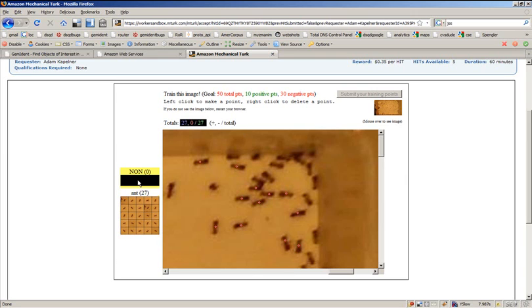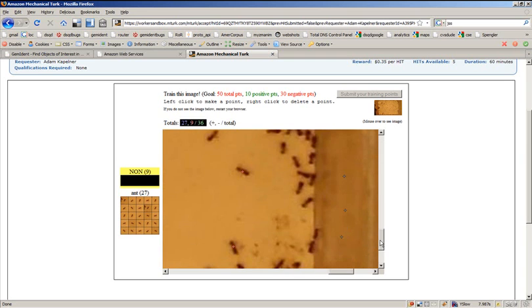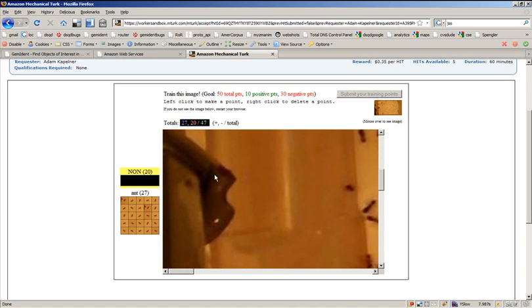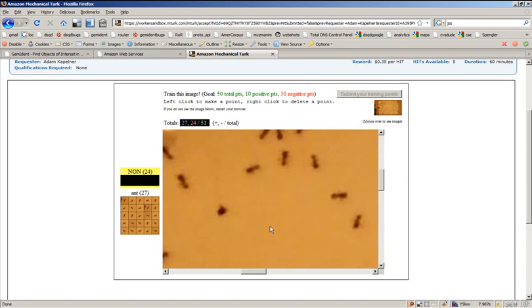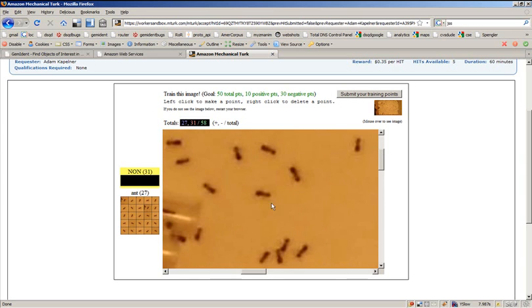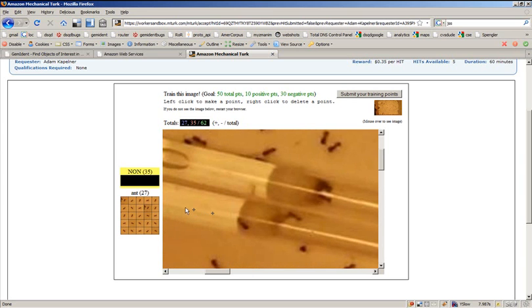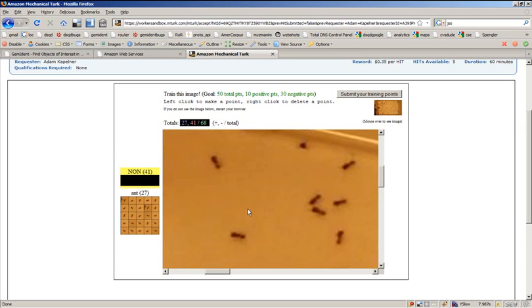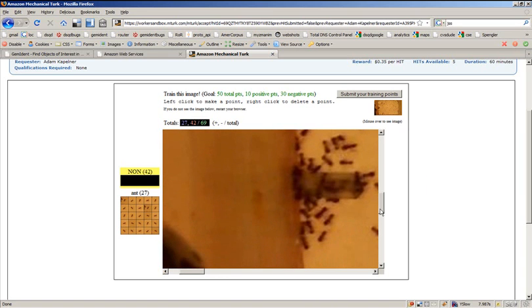That's enough. Let's go on some nons. Side of the bin is nothing. So is the black. Of course, is the background. And this tubing. Maybe this tubing as well.